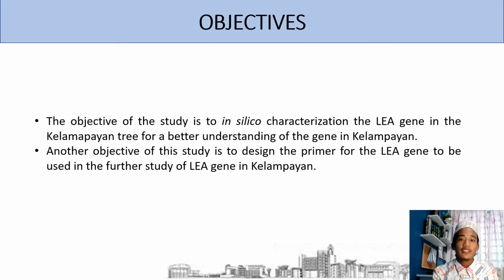The objective of this study is to characterize in silico the LEA gene in the Kelampayan tree for a better understanding of the gene in Kelampayan. Another objective of this study is to design the primer for the LEA gene to be used in the further study of the LEA gene in Kelampayan.